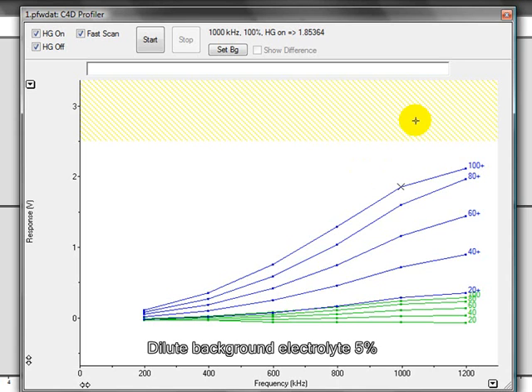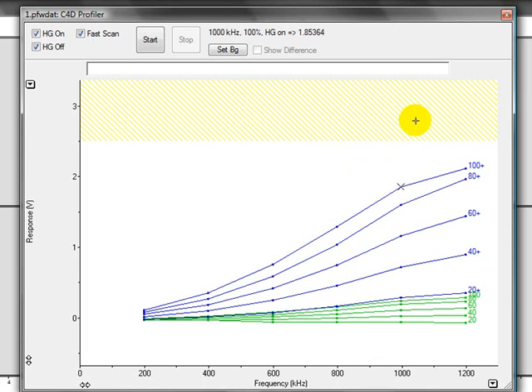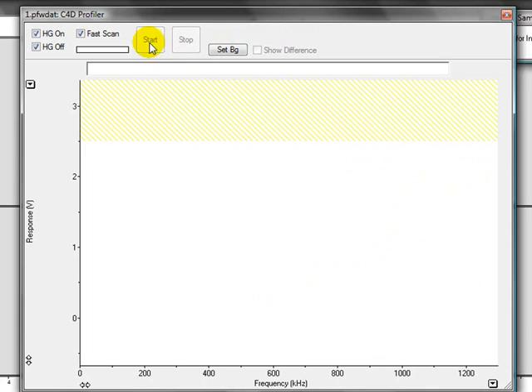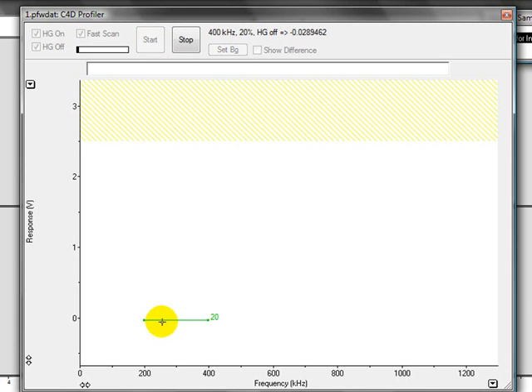You should now dilute your background electrolyte by about 5% using ionized water and inject it into the capillary. Once you are ready to do the second scan, you click start again and the software will draw its plots.